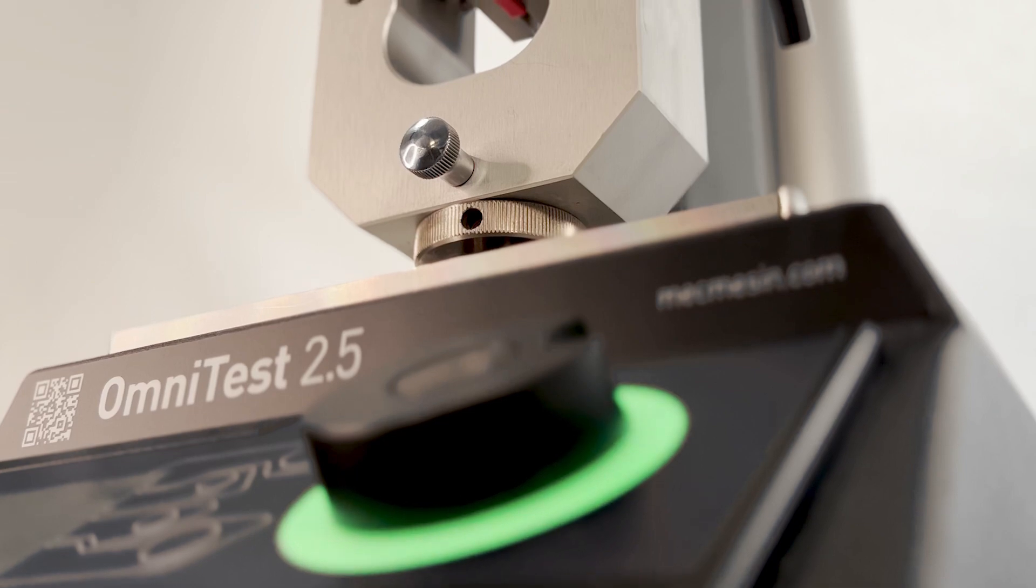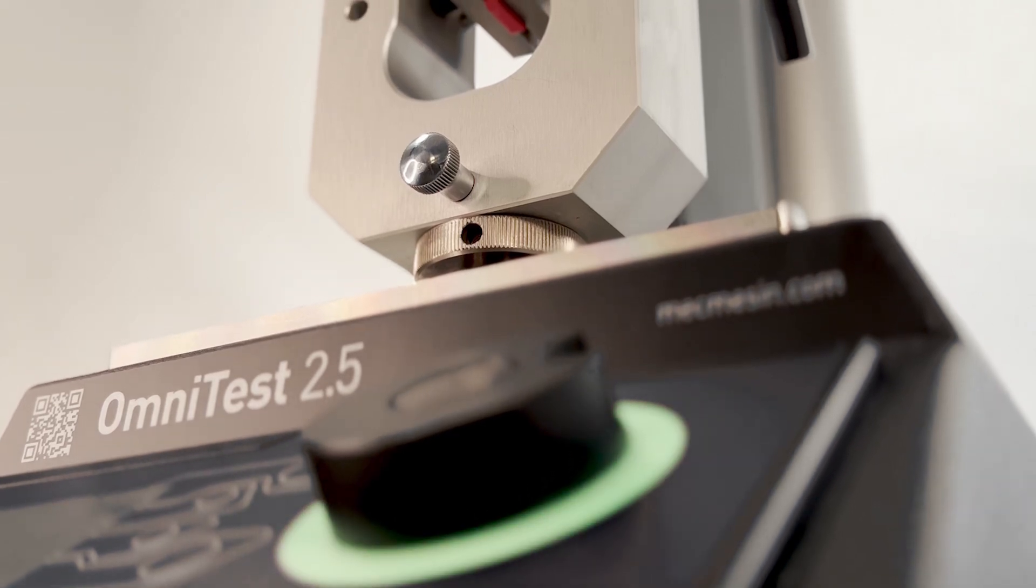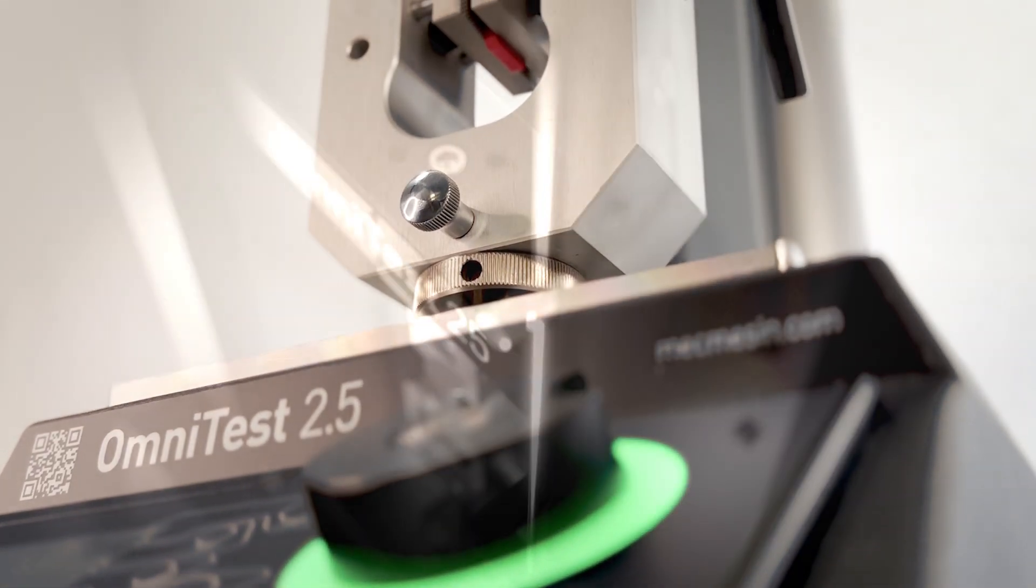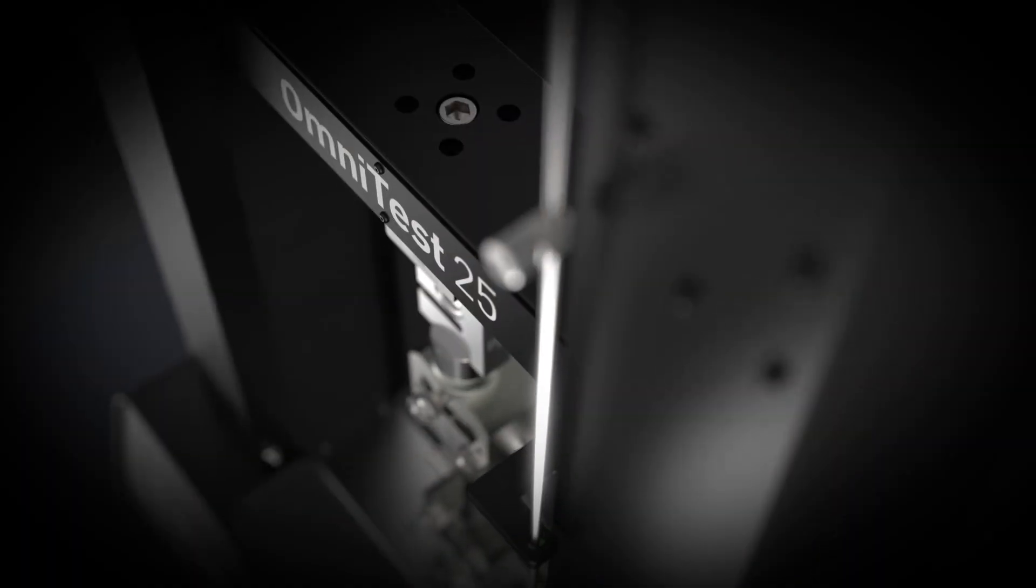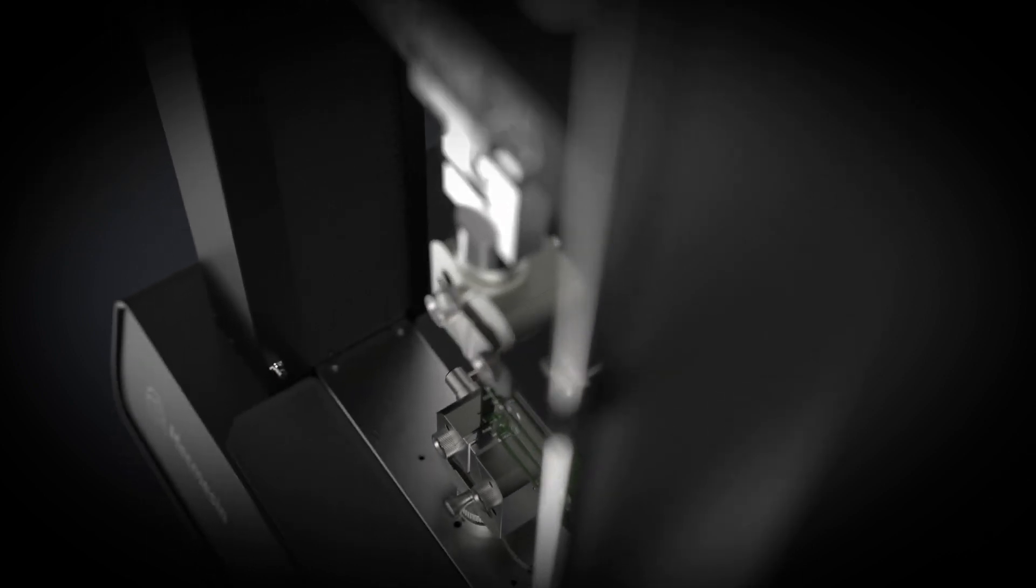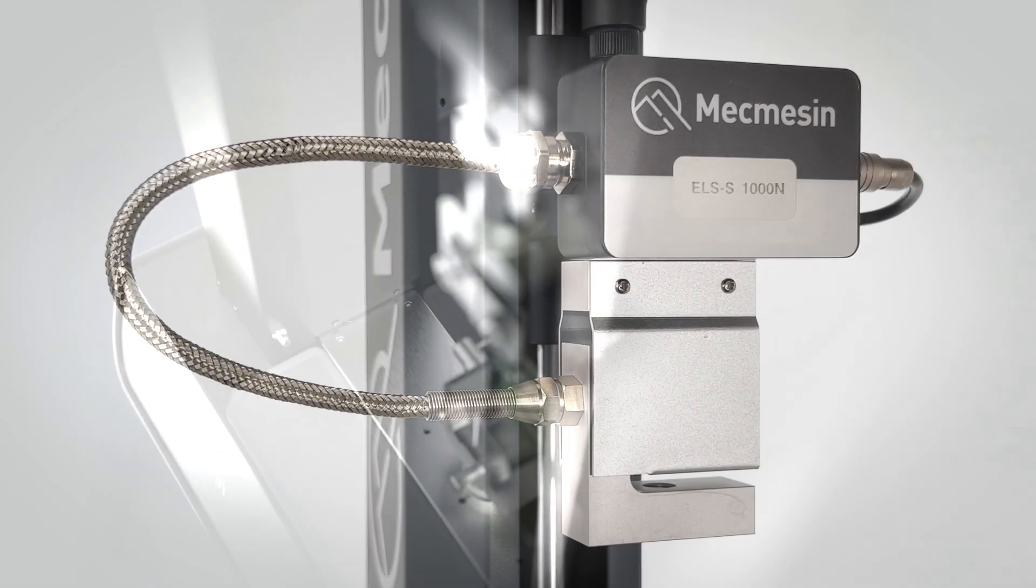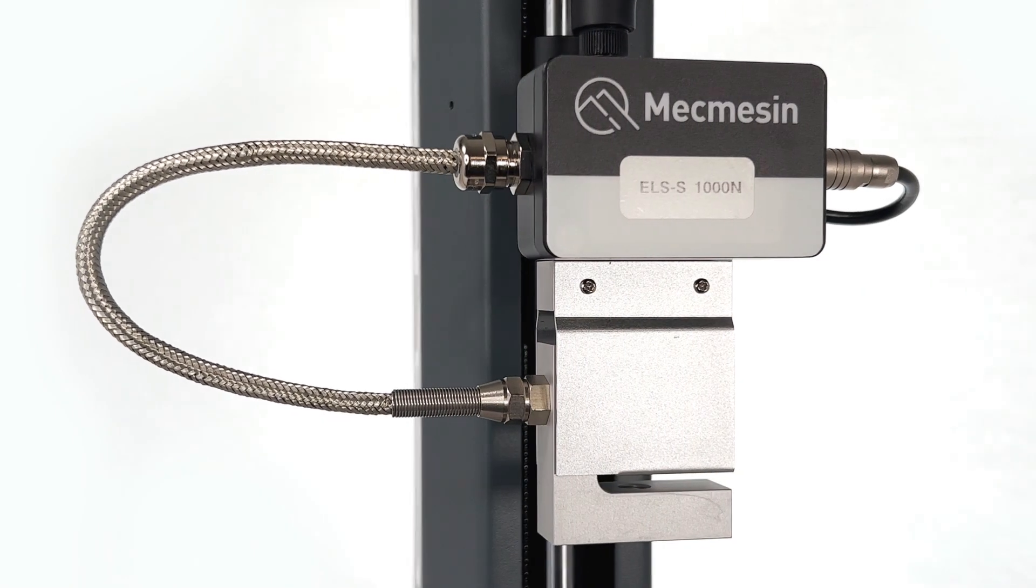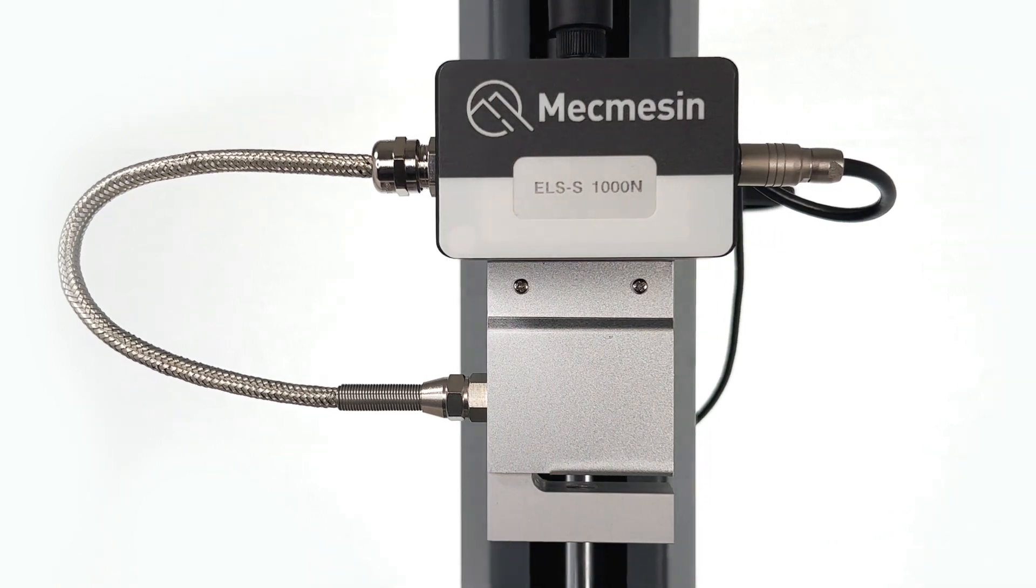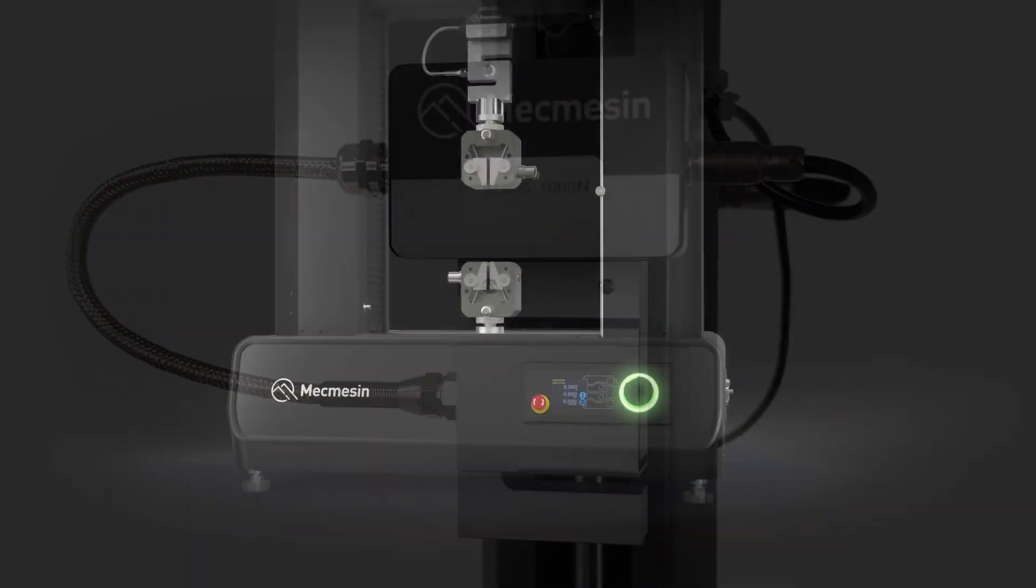There are eight models to choose from for load capacities from 0.5 to 50 kilonewtons. The test frames are available in single and twin column versions to suit the geometry of your test specimen.